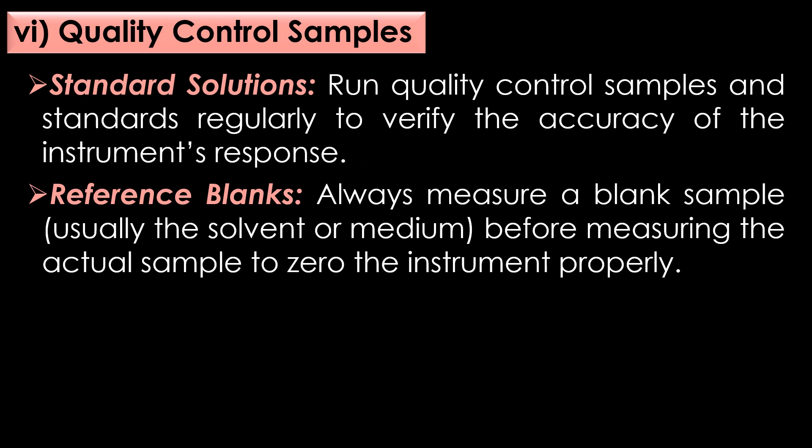Finally, preventive measures in quality control samples. First, standard solutions: run quality control samples and standards regularly to verify the accuracy of the instrument's response. Second, reference blanks: always measure a blank sample, usually the solvent or medium, before measuring the actual sample to zero the instrument properly. By following these preventive measures, you can significantly improve the accuracy, reliability, and consistency of measurements taken with a spectrophotometer.